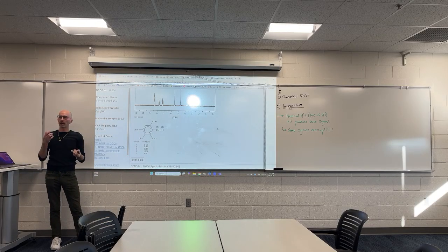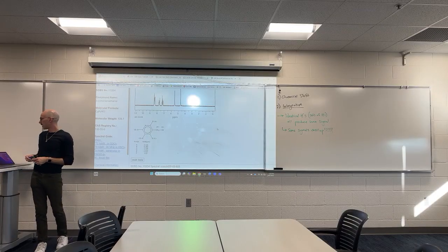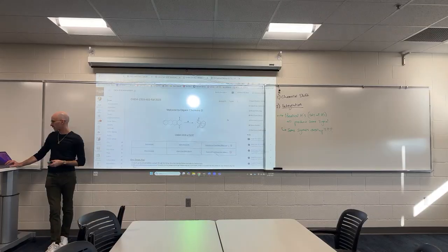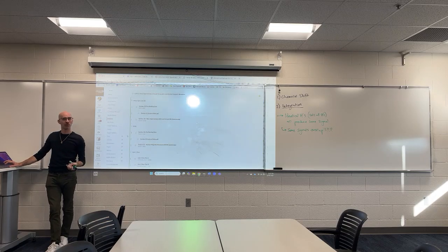So there are instances where you might be asked to decide how many unique sets of hydrogens are here. And you can give a theoretical answer. It doesn't mean it's always going to experimentally show up that way. I want to give you an idea of what I'm talking about.